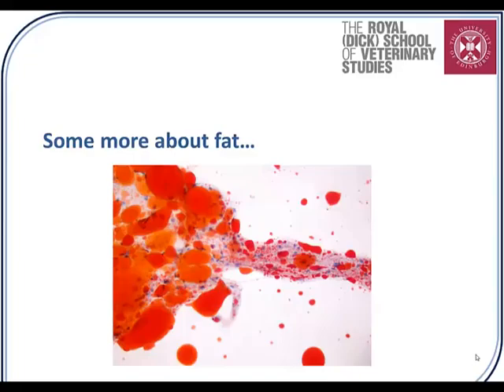Okay, so I thought, given some of the incredibly interesting and useful contributions that I've seen on the discussion forum about the fat question that I left you, which was effectively to say whether or not it was strictly speaking correct to say that an area of fat doesn't stain. And you were quite correct.